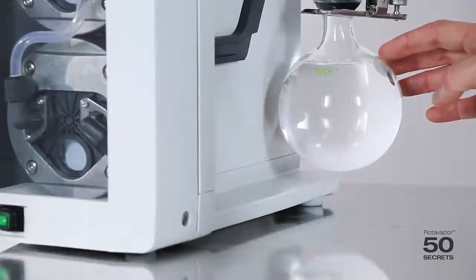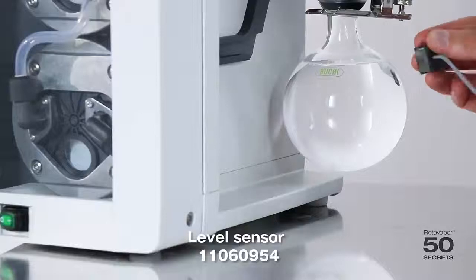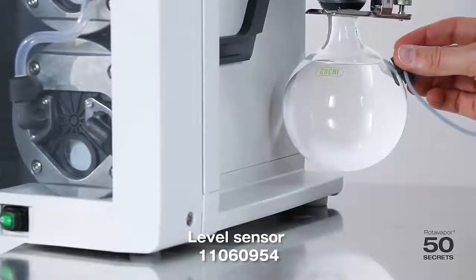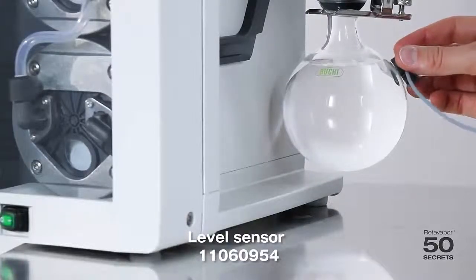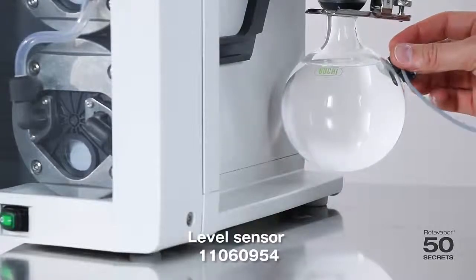Today's secret is all about the level sensor. This is it — the level sensor. We simply mount it over here. This will then give a signal to the vacuum pump and from the vacuum pump to the interface. We'll show you how that looks.